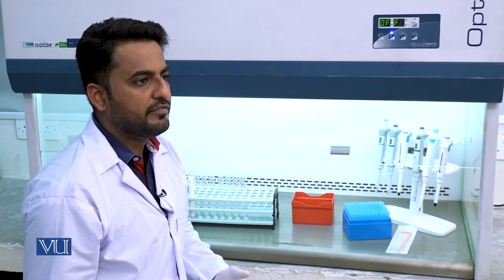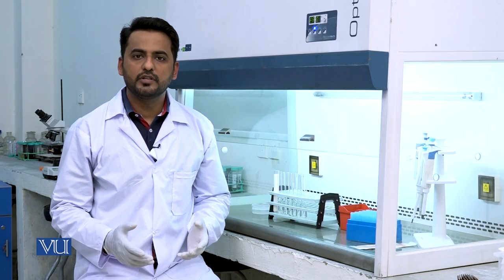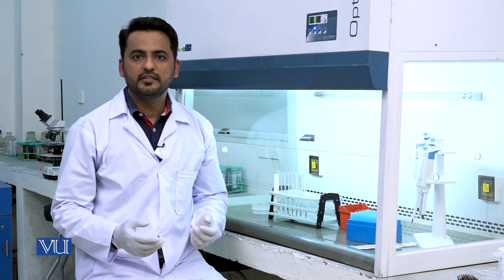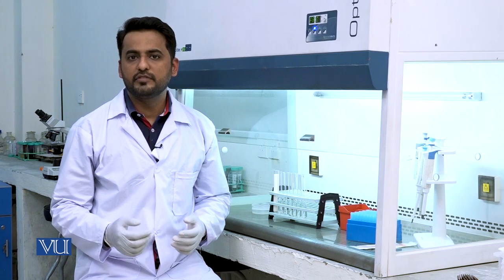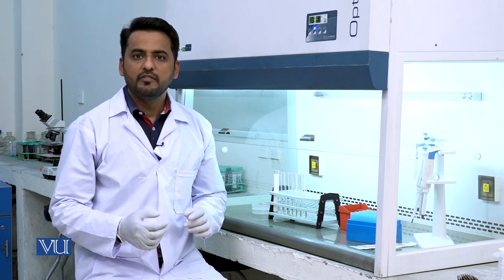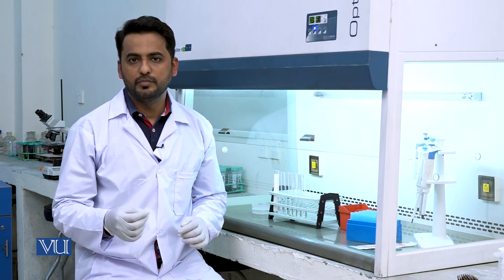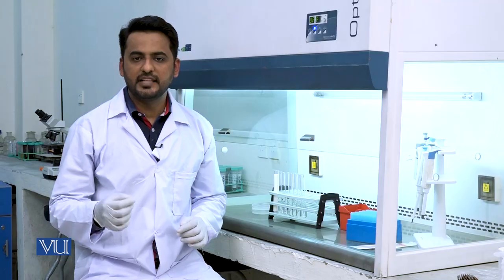In the very first step of this experiment, we will perform the serial dilution of goat milk. In order to do that, we will take a micropipette and take 1 ml of goat milk and mix it into 9 ml of distilled water. And from the second tube, in which we have just added 1 ml of goat milk, we'll take 1 ml of solution and add it into the third tube. And likewise, we will transfer it up to tube number 7.